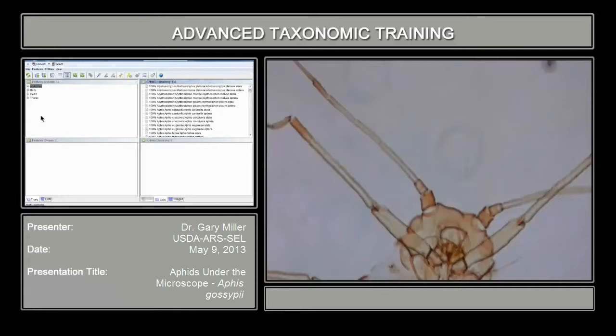this particular key covers 66 of the most polyphagous cosmopolitan aphid species. It includes the species that Blackman and Eastop's books — which are what I call the gold standard for aphid identification — cover, not only those polyphagous species, but also the species that are most commonly intercepted at U.S. ports of entry. So there are some on there that are not recorded in Blackman and Eastop's key.